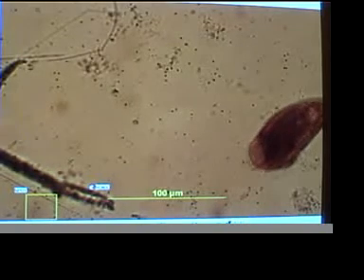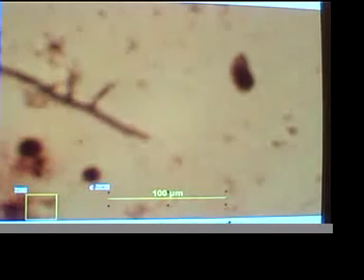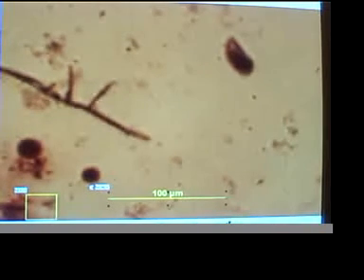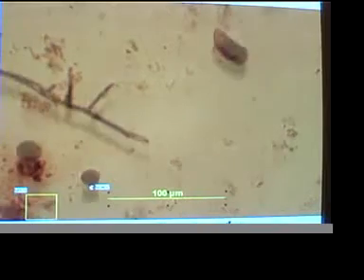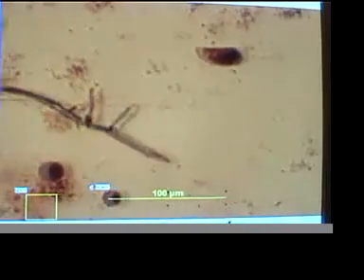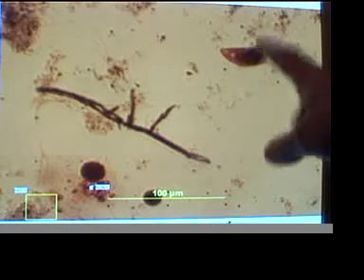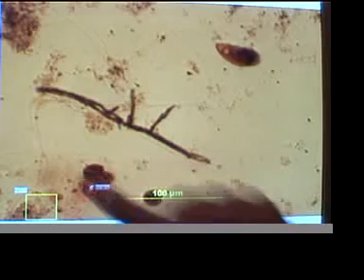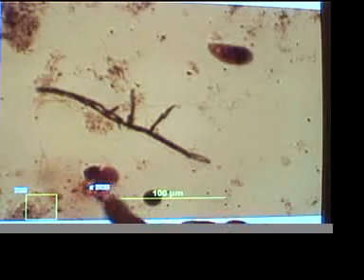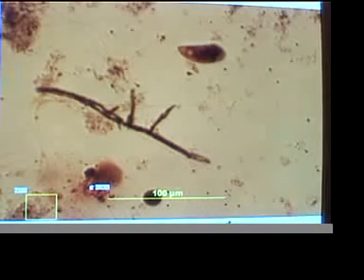If I pull out, let's see, they are right next door in focus. You can see here are the remains in the bottom left quadrant. That organism swimming, this is absolutely fascinating. This was once part of these spheres. Oh, and that sphere just burst. Look at that. And he's still swimming.